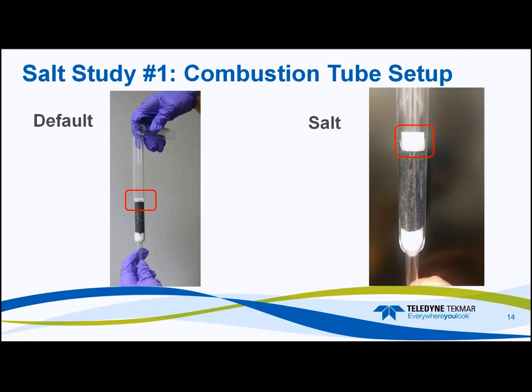And this is what the picture looks like. Over here on the left-hand side, you see the 3 grams of quartz beads over the very tiny catalyst, and we have 1/4 gram of quartz wool. And this is a closer picture: 1/4 gram of quartz wool, 17 grams of small sphere catalyst, try to say that 3 times, and the retainer ring holding in the platinum mesh screen.